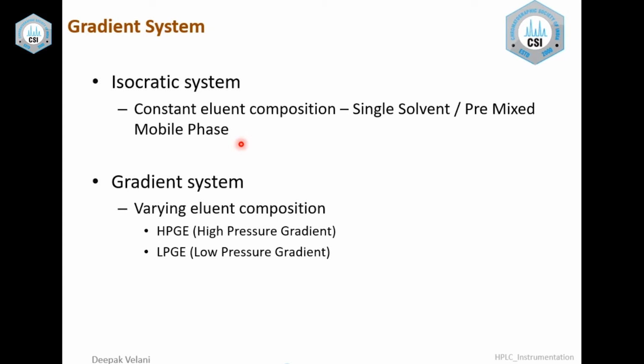Isocratic systems were used with many systems, but majorly now an isocratic system is used with an RI detector. Isocratic systems are not that much preferred by analytical people because of the ease of operation in gradient, the ease of separation, and the efficiency of mixing of the solvents, which reduces run times with better efficiency of separation.